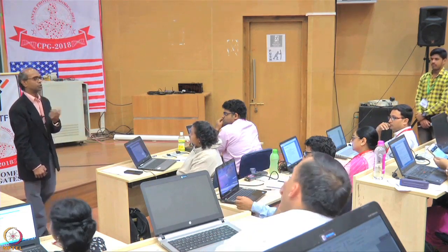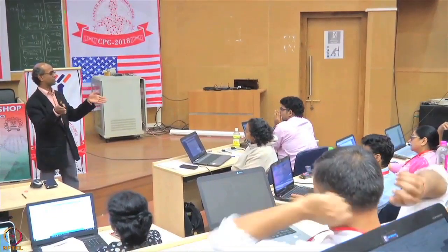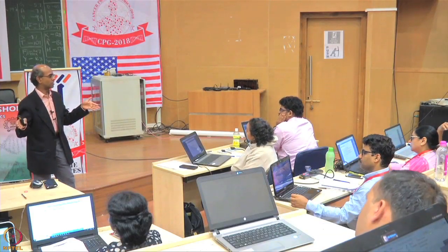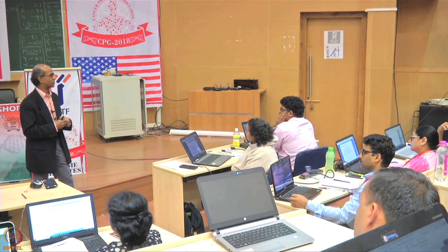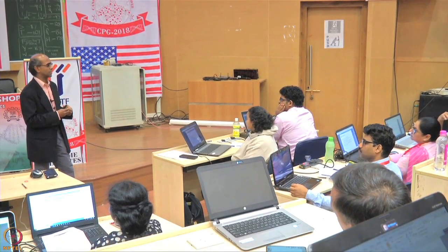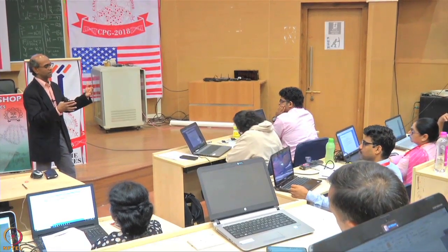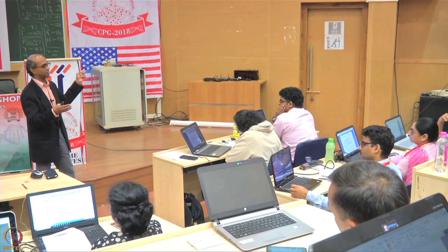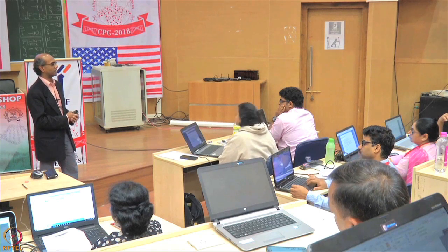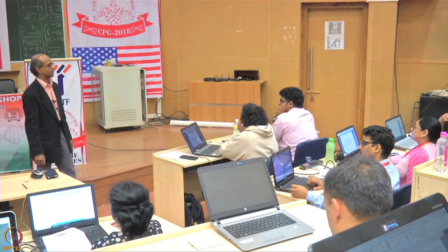So I think the rule of thumb is if your experiment will fit in one TMT reaction, or one TMT experiment, you don't need a reference. But if it is going to span more than one, you should think about having a reference. In some cases, if there are 2 or 3 10-plexes, depending on the conditions and the experiment, maybe you don't need it. But if it is a big discovery study where you have 100 samples and you need to do biomarker discovery or proteomic analysis of all those samples, then you would have a reference.